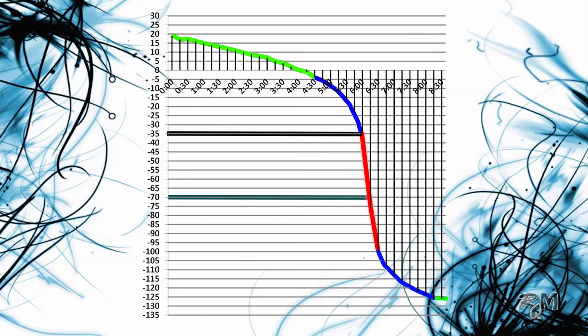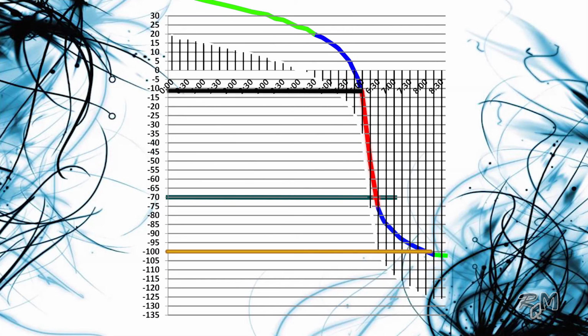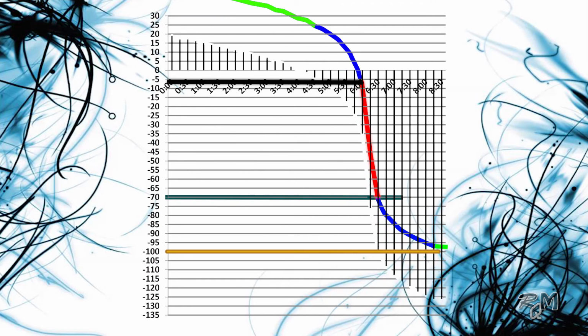In the other case, if you choose the endpoint at the end of the straight line, say minus 100 millivolts, and the auto endpoint starts to drift to the positive side, it is possible that it comes to a region where the millivolt reading remains constant, which will not stop the titration process.